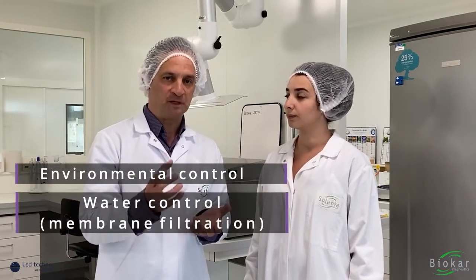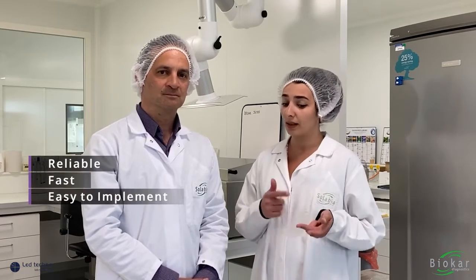Also it is really used in industry for environmental control and for water control with membrane filtration. To conclude in a few words, I would say that this technique is reliable, fast, very easy to implement with easy-to-read results and very flexible.